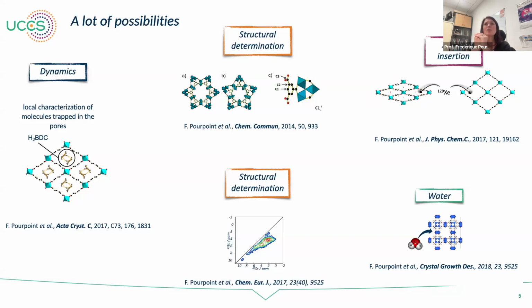We also did, in the MIL-53, the insertion of a gas, xenon, and we did some xenon NMR where we were able to observe the breathing effect of this MOF.